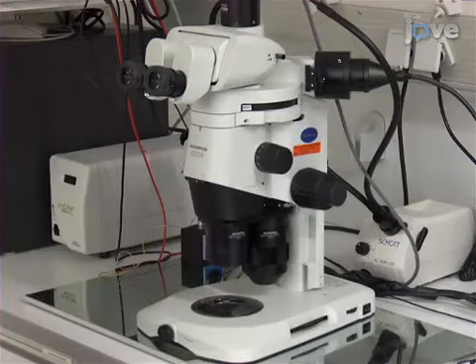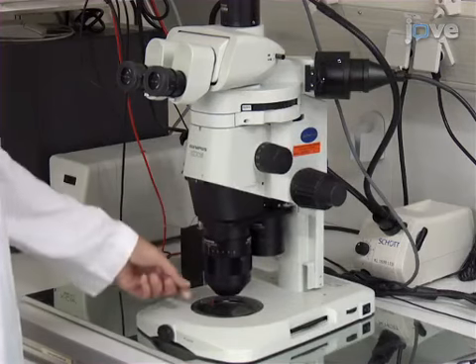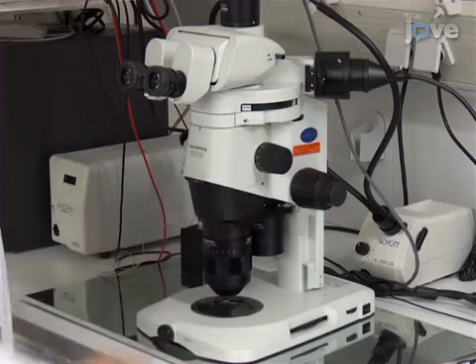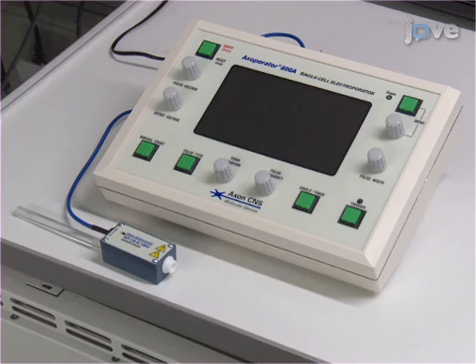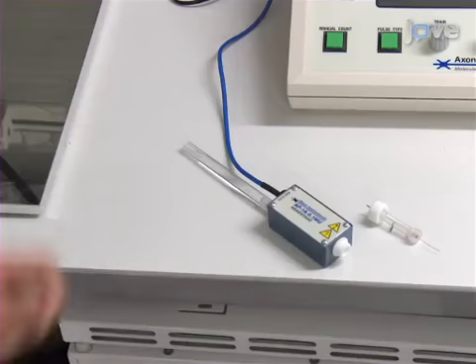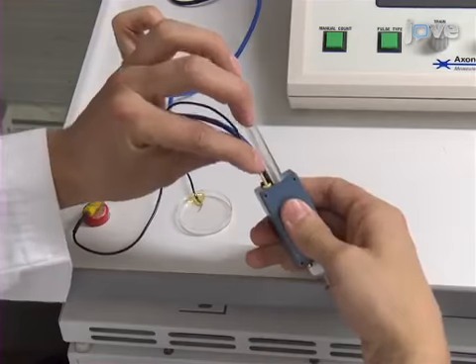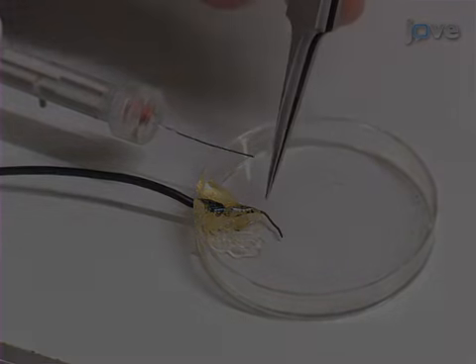Before the experiment, ensure that the electroporation setup consists of a stereo microscope with a large working distance and is equipped with fluorescent illumination and filter sets for the dye used. For electroporation, use either a dedicated single-cell electroporator or a generic square pulse generator attached to an oscilloscope. Connect the electroporator outputs to a pipette holder and a bath electrode. Ensure both the pipette holder and the bath electrode contain silver wire.